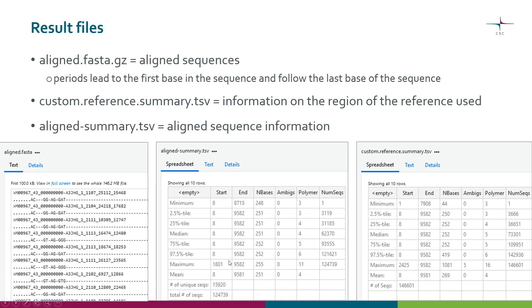This is suspicious. From the reference summary, you can see information about the reference sequences in that area. In my case, I have limited the search to a small part of the SILVA template, so my numbers here are quite small. Again here as well, you can see that there is a strange starting position.